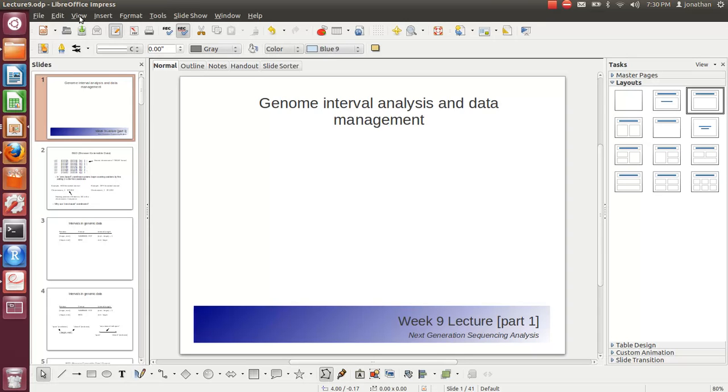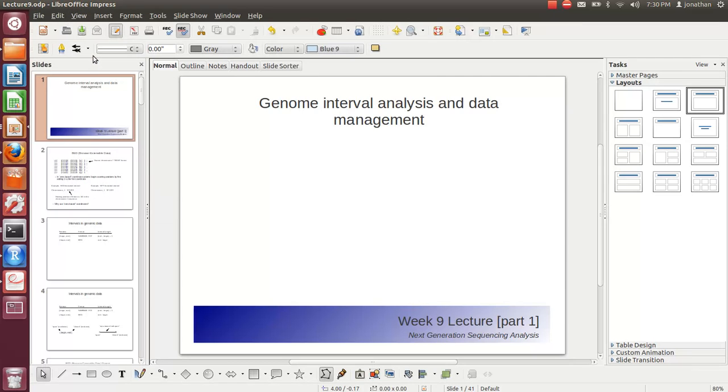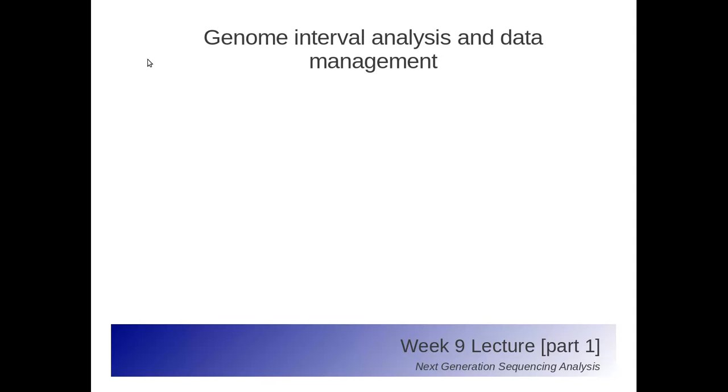So welcome to week 9 of the next generation sequencing analysis course. We've been through a number of applications now in whole genome resequencing. We spent quite a bit of time with the process of alignment and alignment processing, SNP calling, structural variant calling, as well as learning some basics in R and Unix. And we're about to transition now into the world of RNA-seq and studies of gene expression in next-generation sequencing.